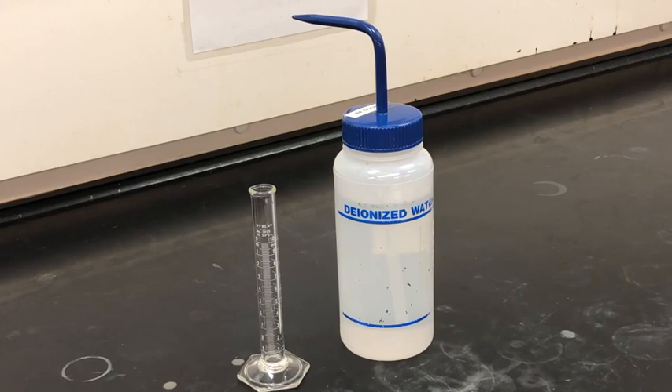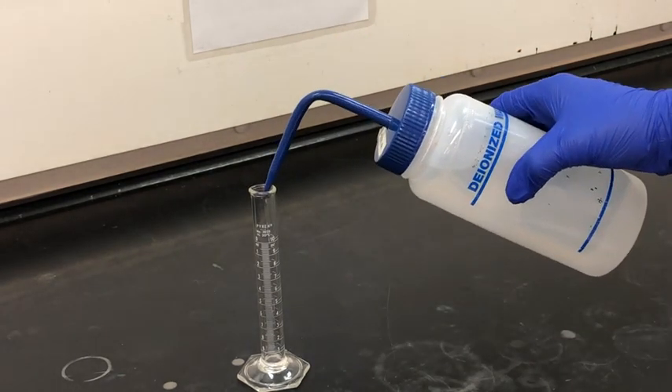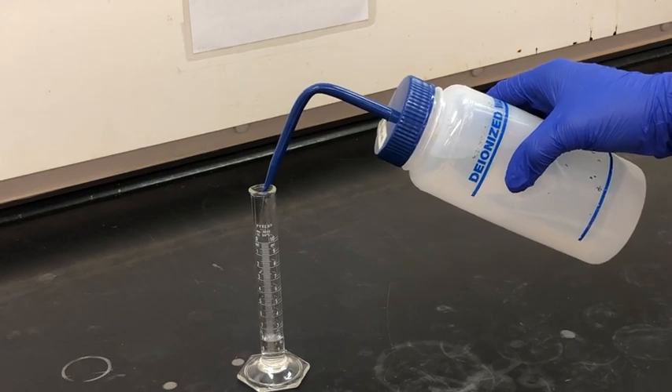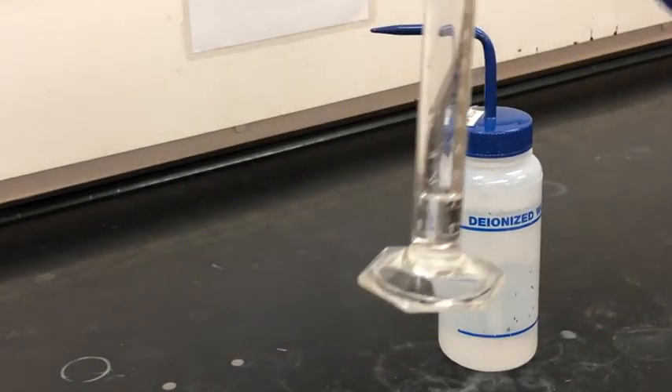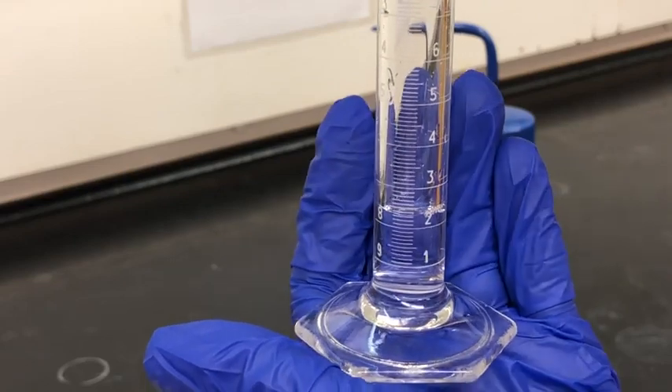In the next step we're going to measure out 2.5 milliliters of deionized water, sometimes also referred to as distilled water — those are interchangeable. Water forms a meniscus in glassware, so we always want to reference the bottom of the meniscus to determine if we have the right amount.